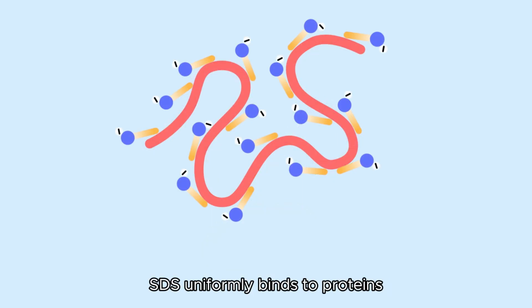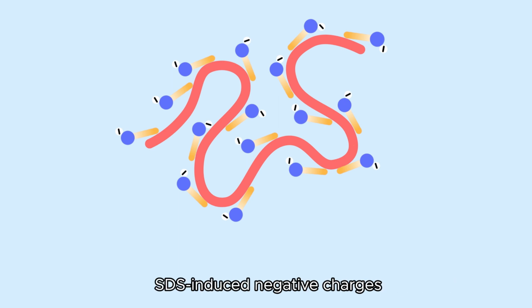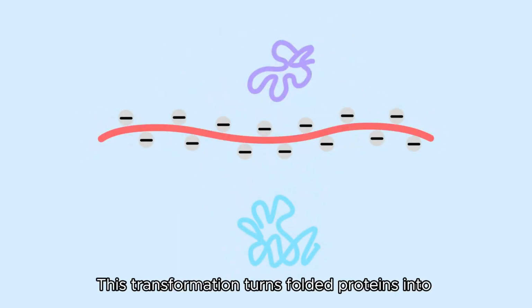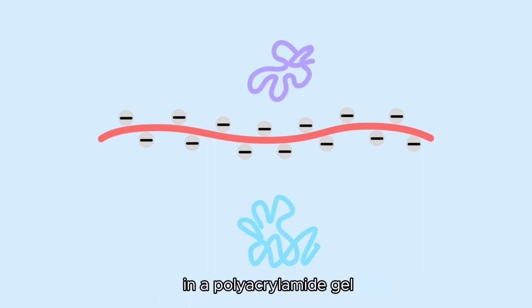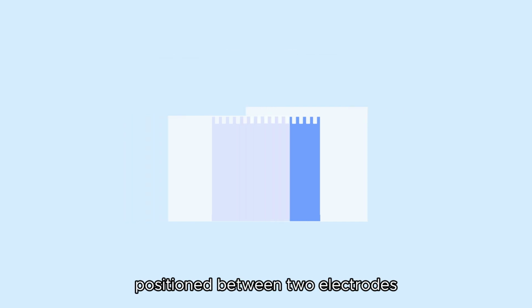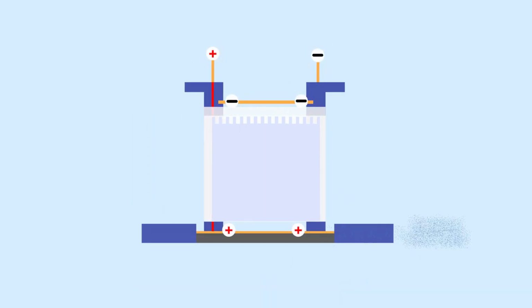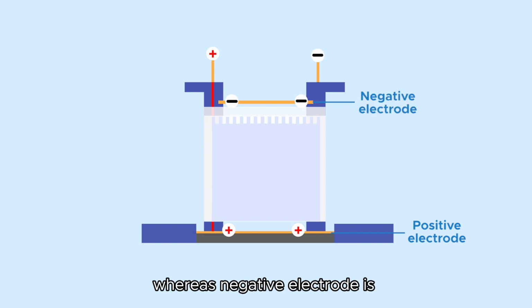Additionally, SDS uniformly binds to proteins, rendering the intrinsic charges negligible compared to SDS-induced negative charges. This transformation turns folded proteins into linear molecules with a net negative charge, allowing separation based on molecular weights in a polyacrylamide gel. The gel forms through polymerization between vertically anchored glass plates in a cassette positioned between two electrodes. The positive electrode is located at the bottom of the gel, whereas the negative electrode is positioned at the top of the gel.